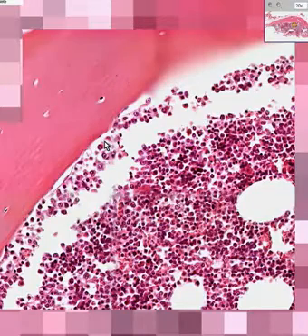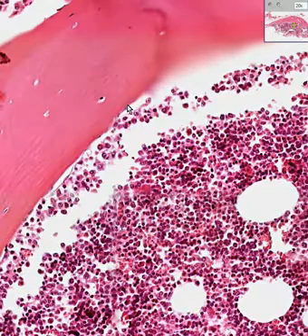So let's take a look at something. We could definitely call this cell, this cell, this cell osteoblasts. As the bone is formed and they're trapped within these concentric lines, these osteoblasts, like you see here and here and here, and probably along here, become osteocytes, just like we saw in Haversian bone, and very similar to the way we saw chondroblasts at the periphery near the perichondrium become chondrocytes within the middle of the matrix. So this is a much simpler form of bone.